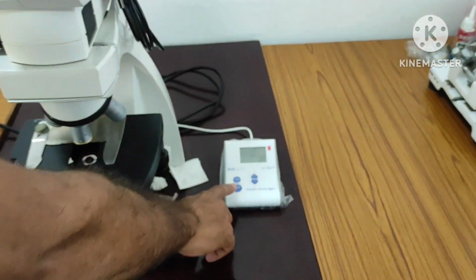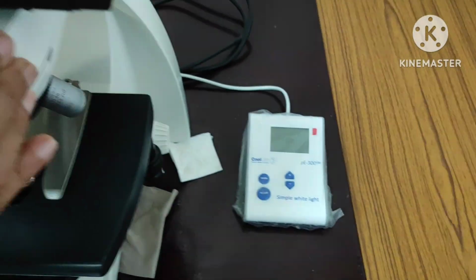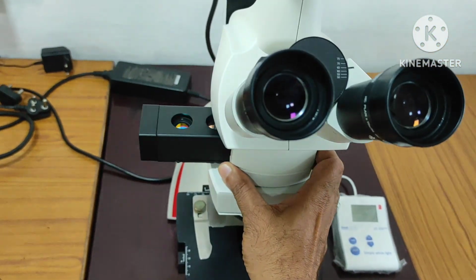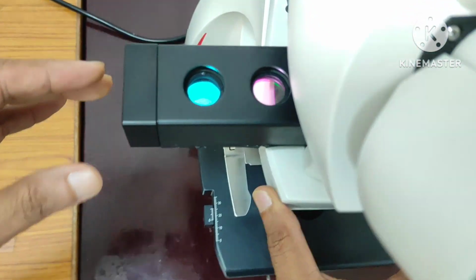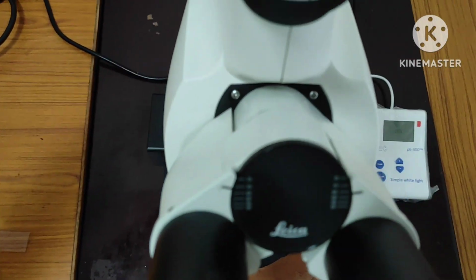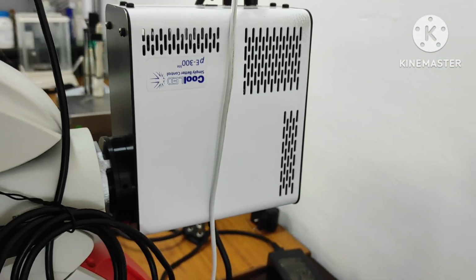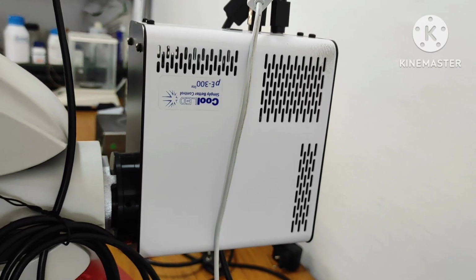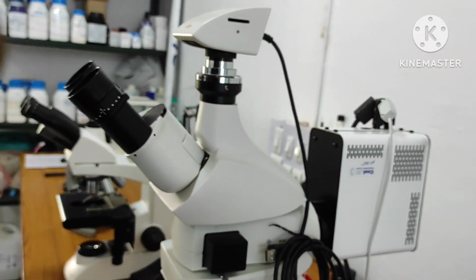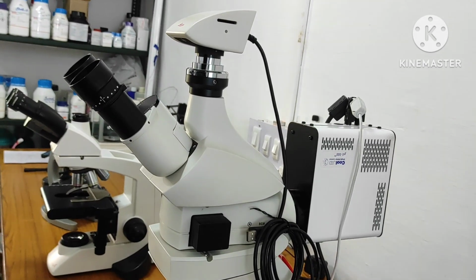Friends, this extra facility is here, right. These are the filters, different kinds of filters present here. So whatever kind of light is needed, that particular filter we can put and observe under the microscope, right. And the last facility that is available with this is this one, and that is part of fluorescence microscopy. So extra facilities are available with that. So this is all about some kinds of microscopes, right. Even one more microscope I will show you, just wait for some time.